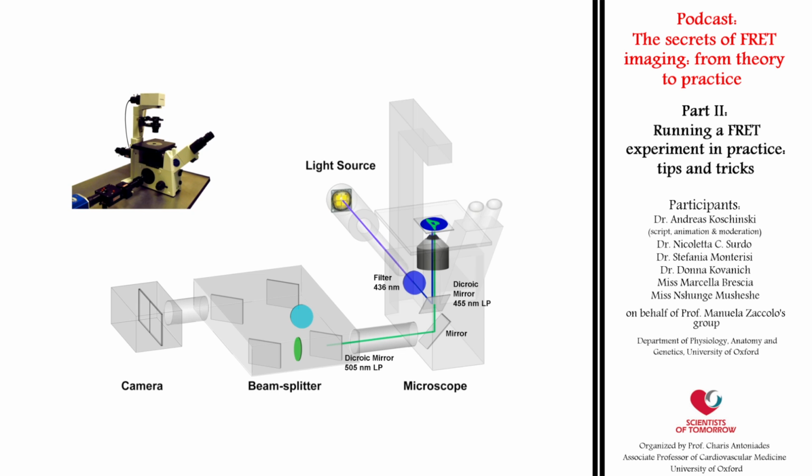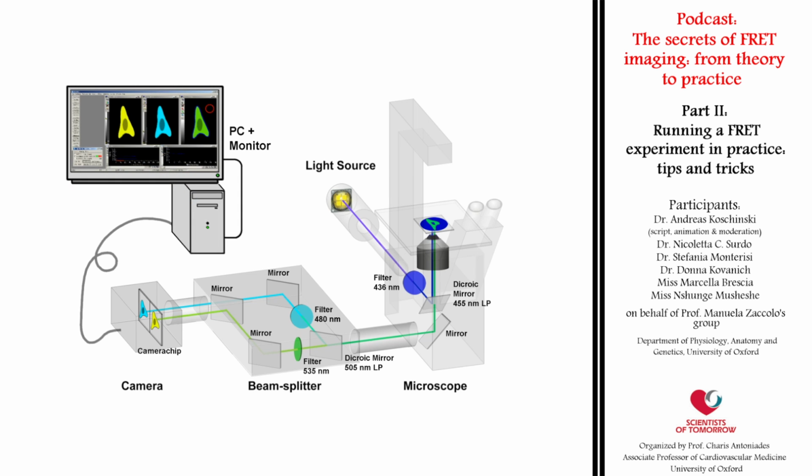As they have longer wavelength, they can now pass through the selective so-called dichroic mirror. Then they are reflected to the beam splitter. By passing through the dichroic mirror and the filters in this device, the previously combined emissions are separated into the yellow and cyan emissions, which then are reflected by other mirrors to separate parts of the light-sensitive chip in the camera. This chip converts the image pixel by pixel into fluorescence intensity values, which then can be converted into storable data and are visualized online on the screen.